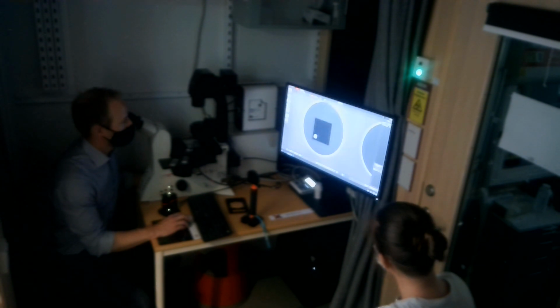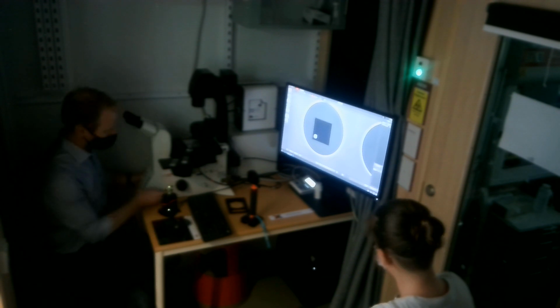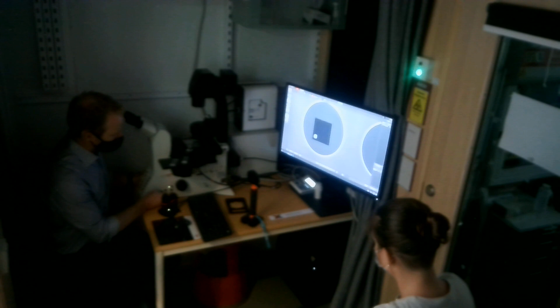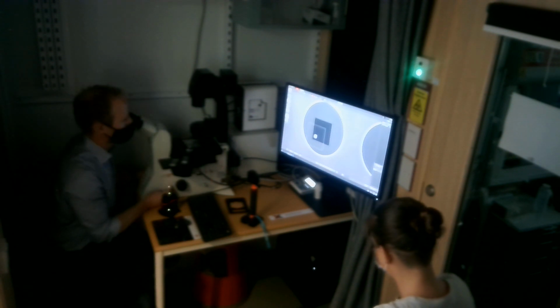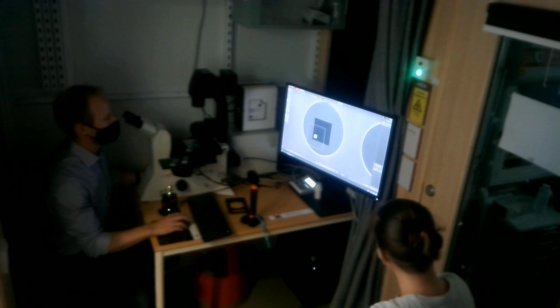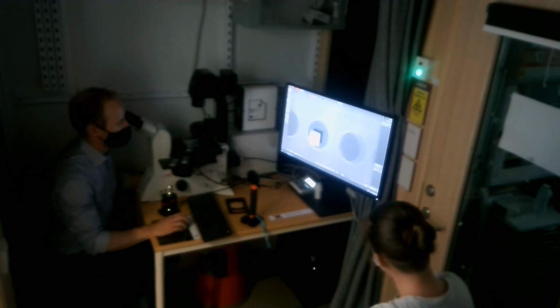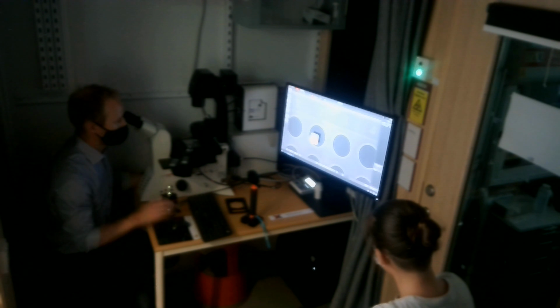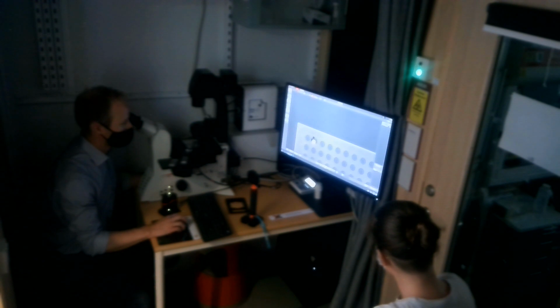So what I will do now, because I don't know this carrier, I lower and I go to the 5x. Go back up, and now just using Brightfield, I will just see if I can basically, I'll do like this. And we said that it was roughly these ones, right? Yeah.